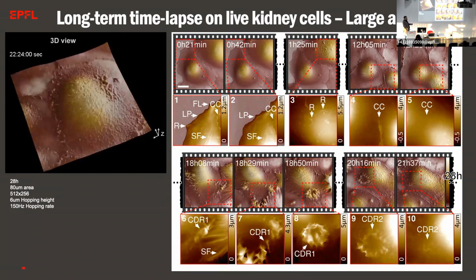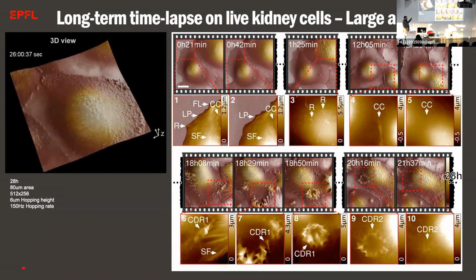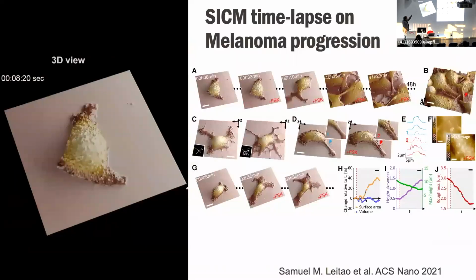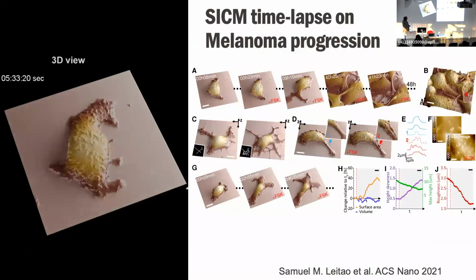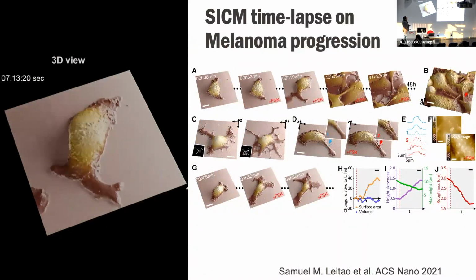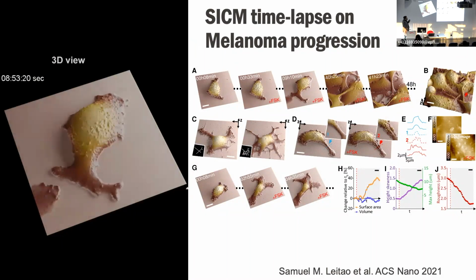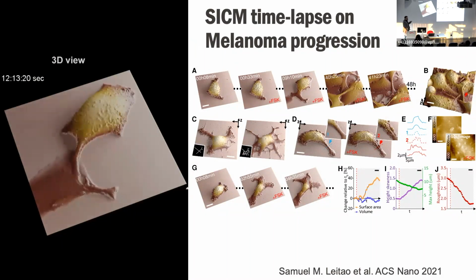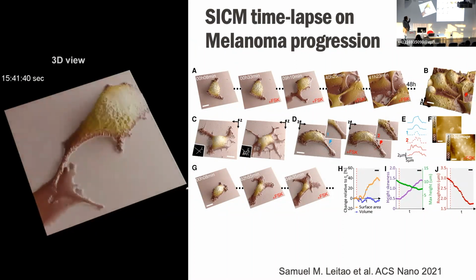I've seen images like this from scanning electron microscopes, where you see the 3D structure of the cells, but they just were dead. And I like to look at this imaging mode now as a way that we can spy with a little nanoscale video camera on the cells without them complaining about it, and really see how they develop, how they grow.